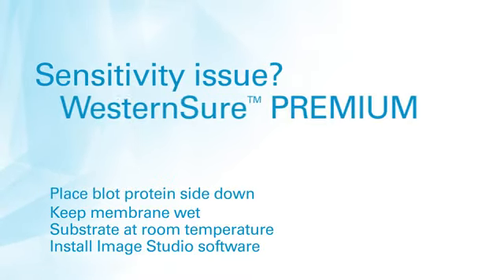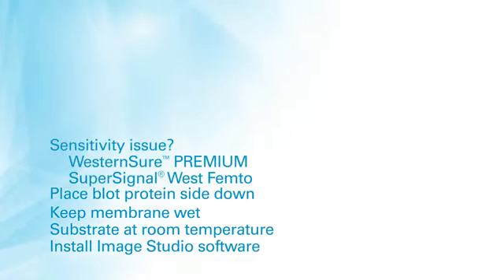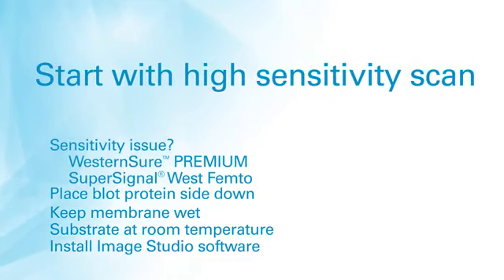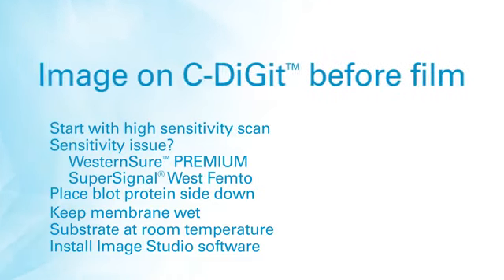If sensitivity is an issue, then we recommend these substrates. Try the high sensitivity setting for your first scan and work from there. And if you're doing a comparison, let's be fair. Image on the C-Digit first and then expose your film.